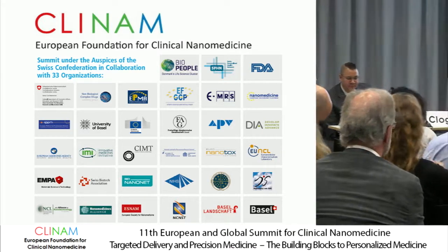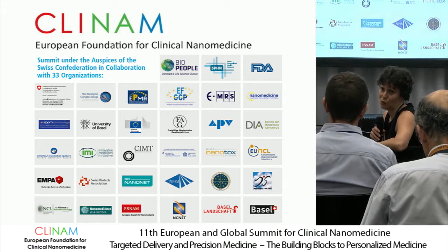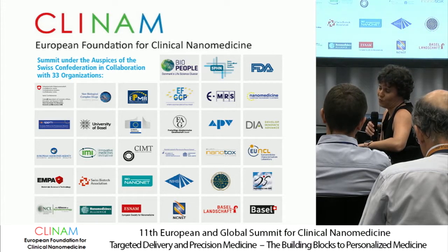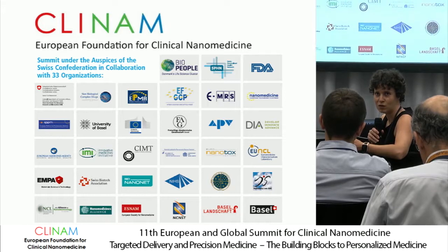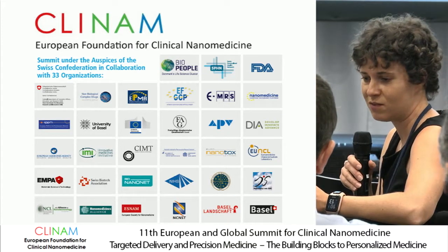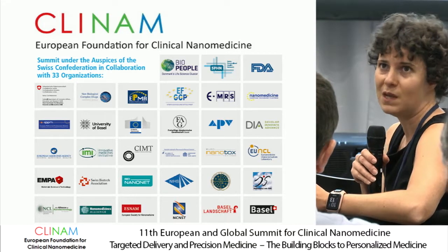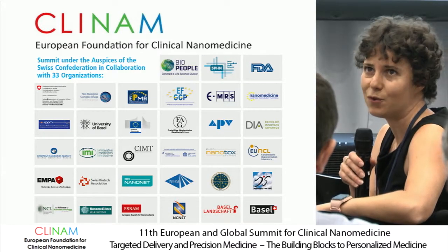Honestly, I think we should put more effort into showing that to people. We know that, but people out there sometimes just don't know how to use some instrumentation, and especially when things seem very simple, the risk is very high, especially with DLS, but that may apply to many other techniques.